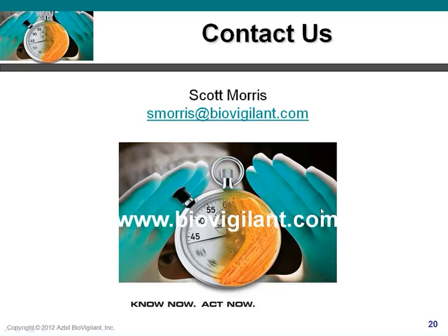There's a good return on investment. But both customers and regulatory agencies are not necessarily interested in trying to complete that transition immediately. They want to build up some historical data and build confidence that the data they're collecting with the new method is really giving them assurance that they're continuing to maintain a quality environment.